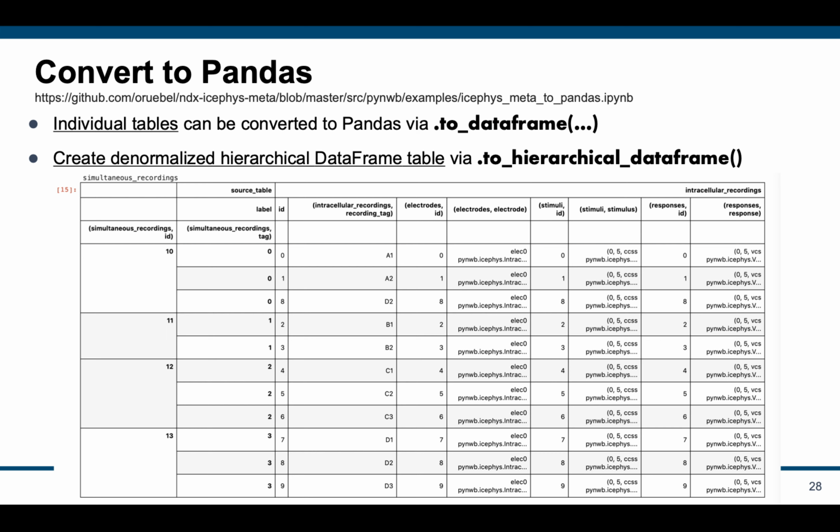can populate the data sequentially as the data is being acquired, so that this approach is also much more amenable to how data is being acquired rather than if we were to store everything as a single large denormalized table, which would require us to populate all the information at once.